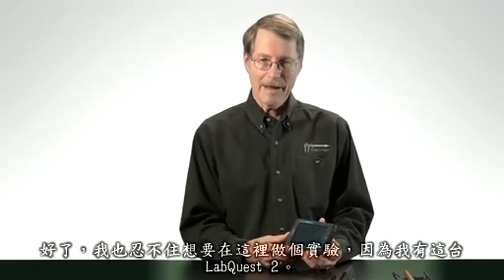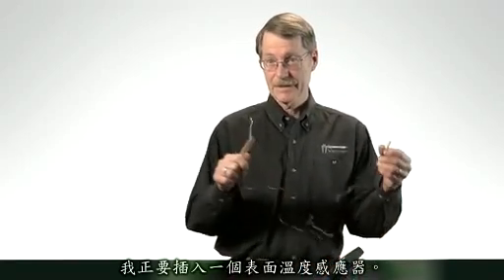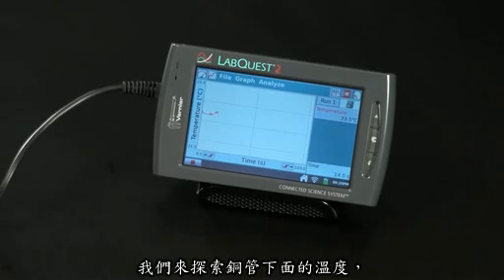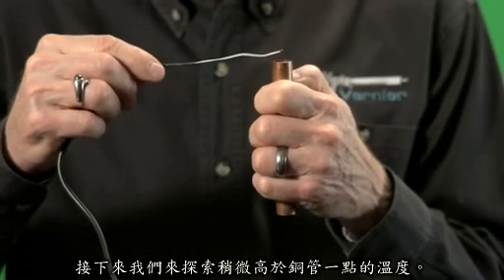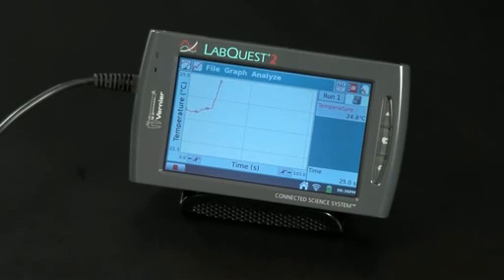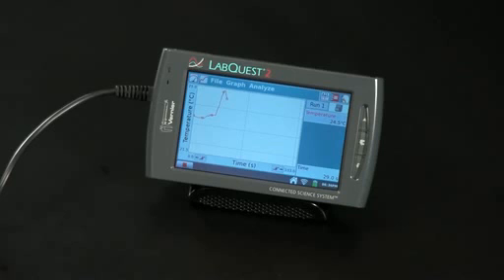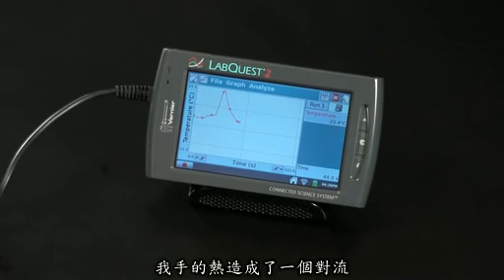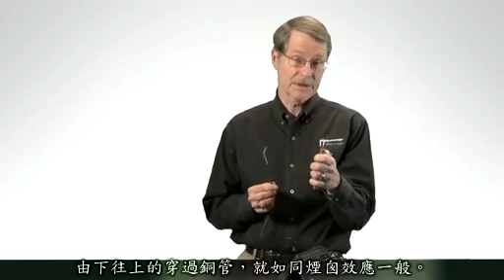I can't resist doing a lab here. I'm going to plug in a surface temperature sensor — it's a very sensitive temperature sensor that we sell. And I've got a copper tube. Let me do a quick experiment: I'm going to explore the temperature below the copper tube. And now let's explore a little bit above the copper tube. Let's go back down below. The whole idea is to show that there's heating from my hand and a convection current coming up through the copper tube — you get a chimney effect.